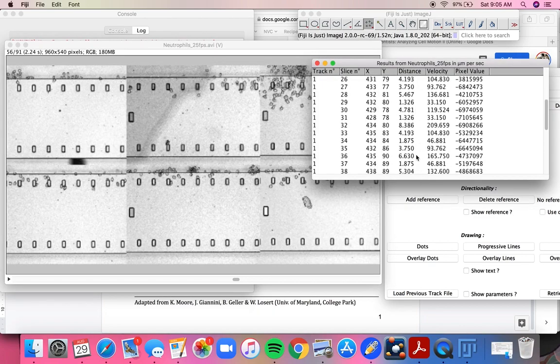So you guys kind of get the idea. The speed is roughly somewhere between 74 and 136, right? That's a typical value that we're getting on this guy. There's some frames where the white blood cell may stop for a second. Those aren't interesting because you're not actually finding his velocity, but you just want to get a ballpark image of what the speed of this guy is.